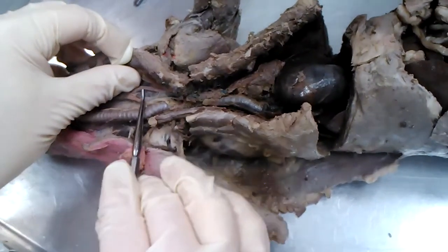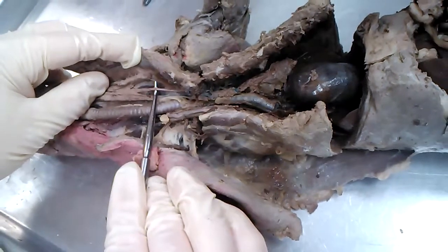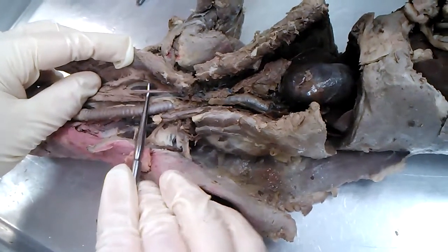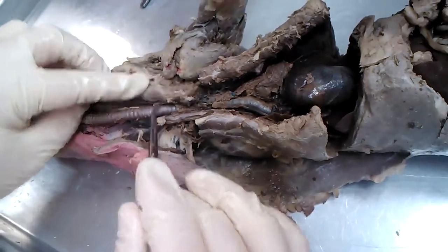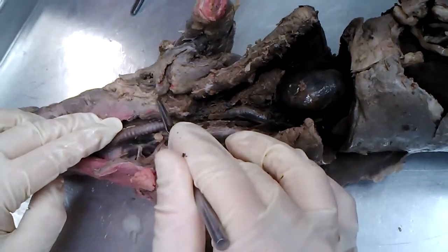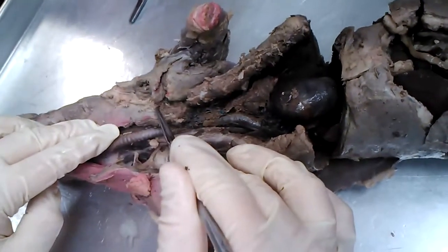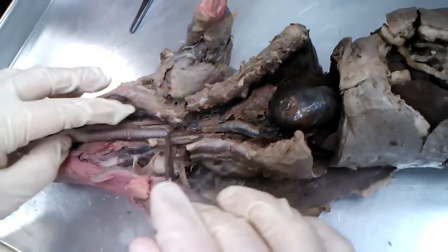Right beside it here, the artery would be the left common carotid artery. The vein that does not show up here would be the left internal jugular vein. A vein, by the way, on the outside running through this area would be the external jugular vein, but again, on this mink does not show up quite as well. All right? So those are structures we can see here again in the neck cervical region.